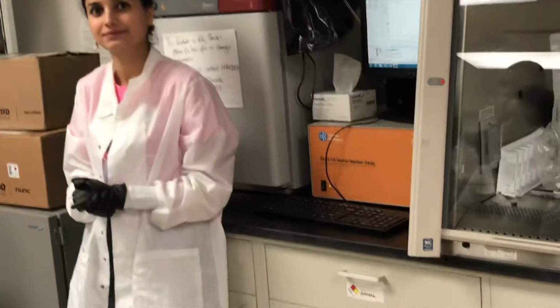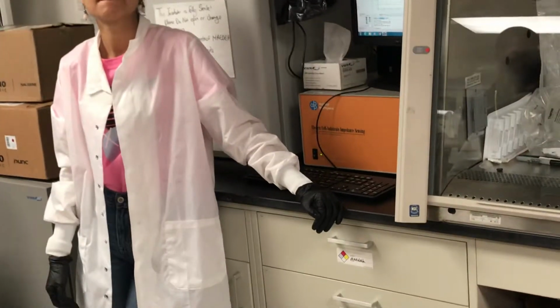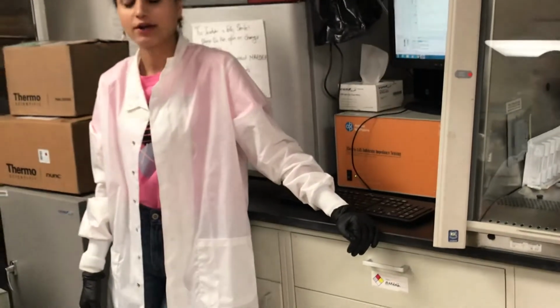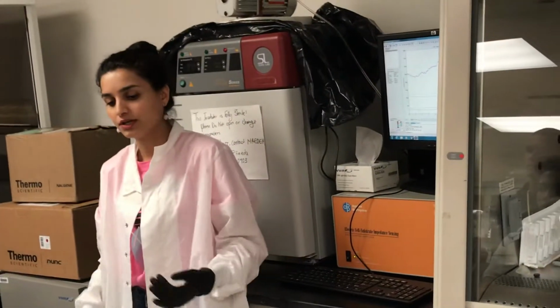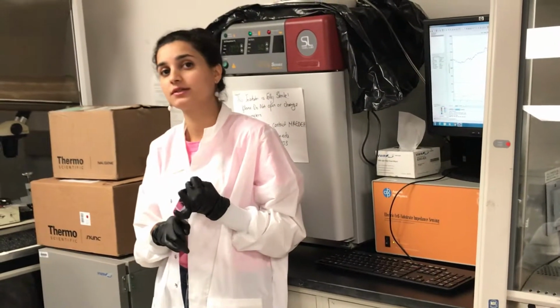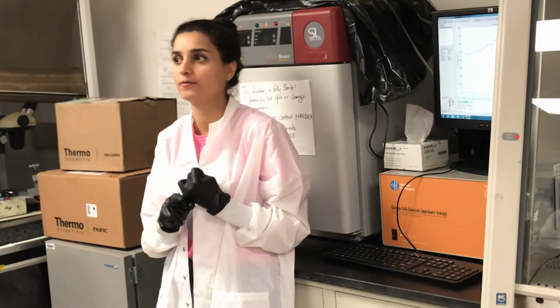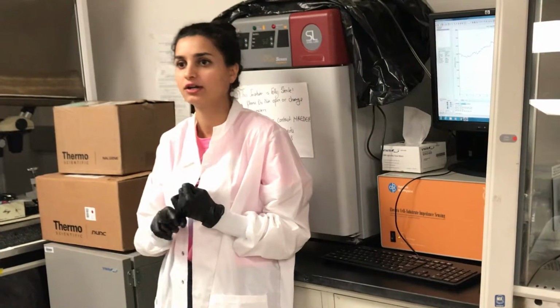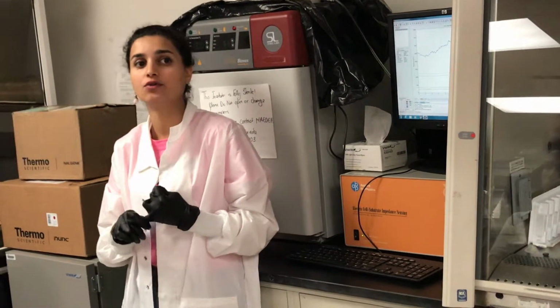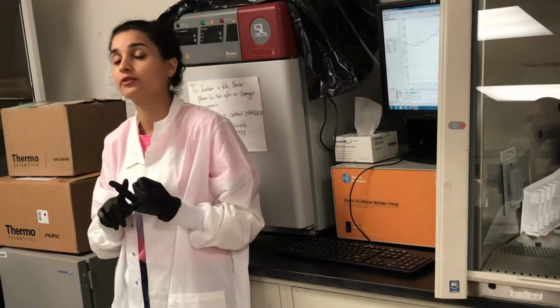Can I ask you another question? Of course. After you have beating cells, what do you do with them? What are you taking this experiment to? That's a really good question. Right now in my project, we monitor how fast they beat without anything invasive, optically using a microscope and using different techniques like SPR. We monitor how they beat, how fast, what the frequency is, and what the effect of drugs is on them.